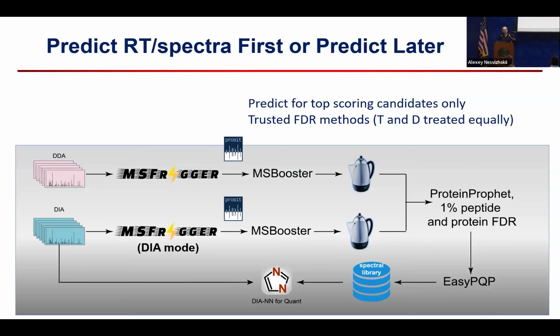One difference, for those of you who are into DIA, between how we approach things and the pure peptide-centric scoring is the question of when you start using deep learning-based predictions. In a peptide-centric strategy, you basically say, I can predict retention times at the beginning for the whole database, and I'm going to go to my very, very complex data with a very narrow retention time window, only look in that window and find something, and then quickly generate a decoy and test there. That's really a dangerous strategy, because you're not looking for modified peptides. You're not looking for other artifacts that are in the data. You just look for a particular unmodified tryptic peptide in a narrow retention time window that the software predicted for you. So that has a problem with FDR estimation.